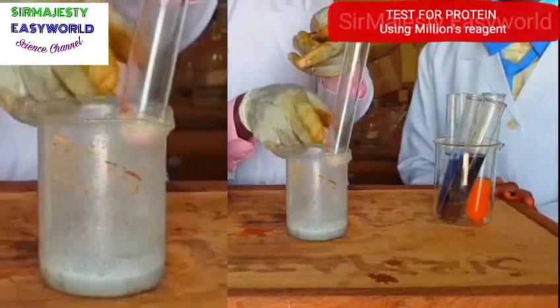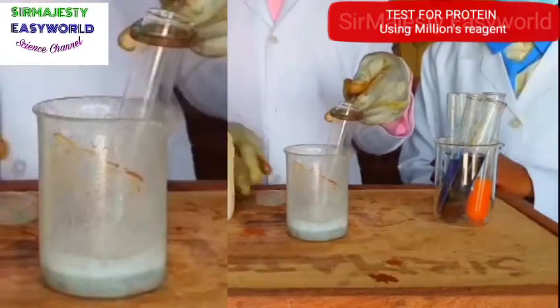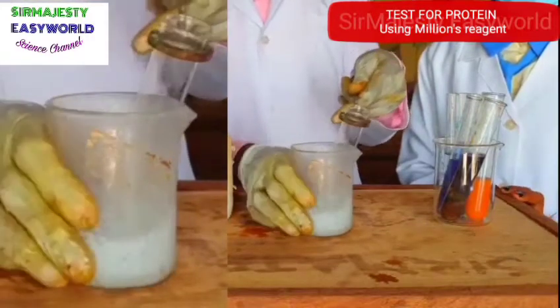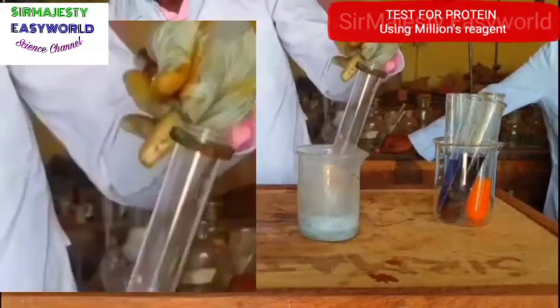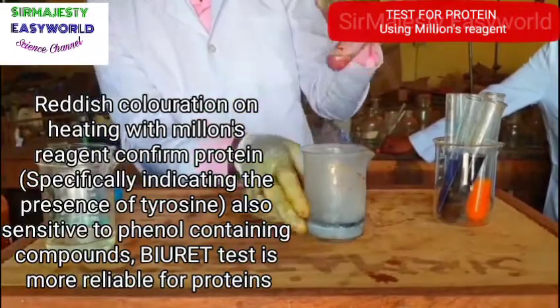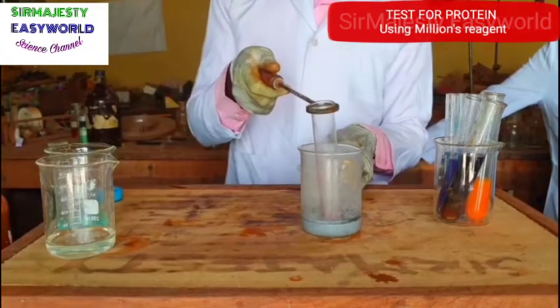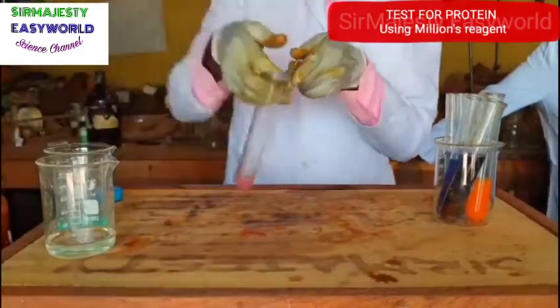Is it turning reddish? Yes, it's warm. Watch it — is it not red now? On heating or warming, it turns red. So that indicates the presence of protein. Name the two reagents you can use to test for protein: Millon's reagent and the Biuret test.